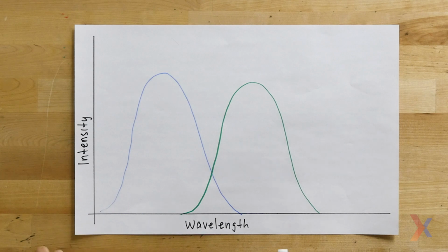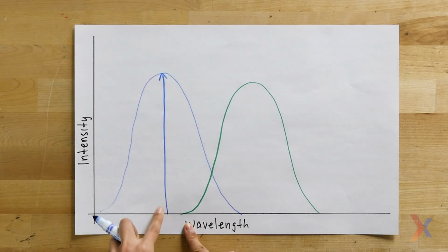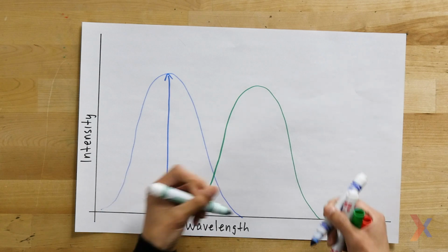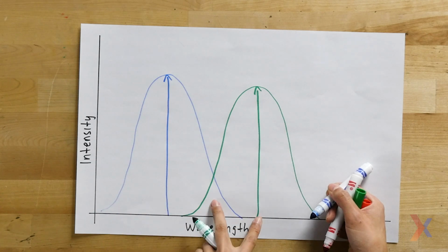The optimum level of fluorescence would be if you're able to excite at the highest possible intensity of your excitation wavelengths, which will allow you to emit at the highest possible intensity for your emission and give you the strongest light production from your fluorescence.